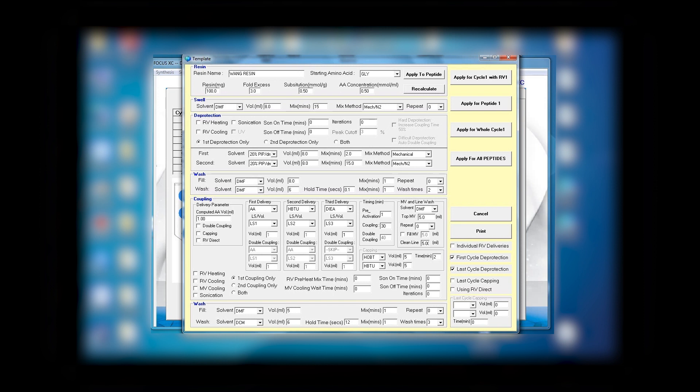Depending on how many peptides you have and what protocols you want to use, so this gives you options to have different chemistry for each reactor. Since I have only one reactor, I select apply to cycle one with RV one.